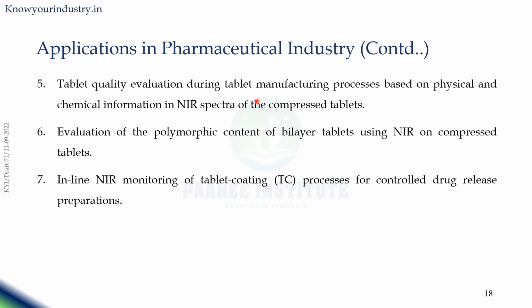Tablet quality evaluation during the tablet manufacturing process, based on the physical and chemical information in the near IR spectra of the compressed tablets, is also one of the applications of infrared spectroscopy in pharmaceutical manufacturing. Evaluation of polymorphic content of bilayer tablets is also done using NIR spectra.